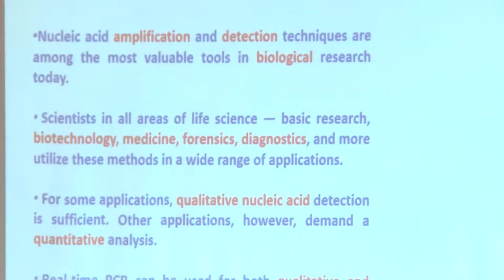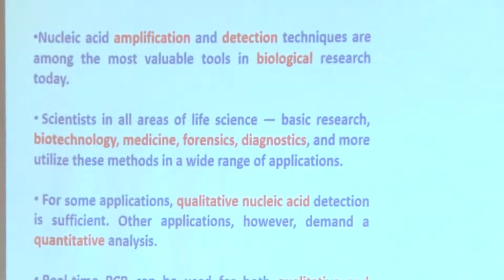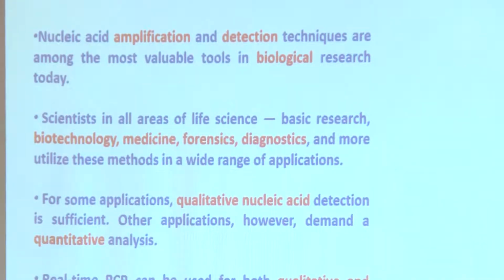Okay. The real-time PCR can be used for both qualitative and quantitative analysis. For the students level, PCR is the one, a normal PCR. By making a statement PCR, what I mean is a normal PCR, that is typically qualitative in nature, right.